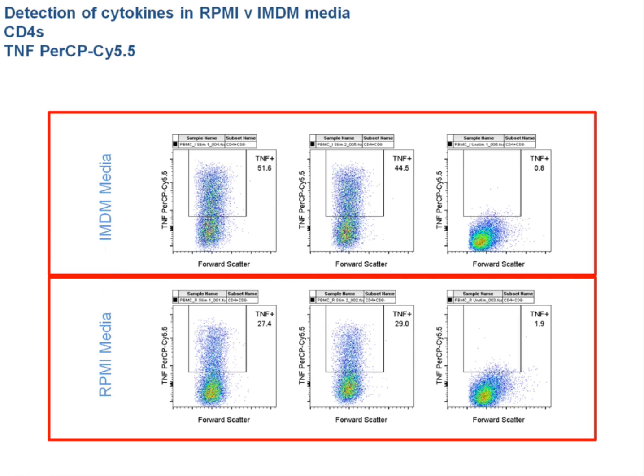Okay, and do you stimulate and block the cells at the same time, or does it matter? Again, in my hands, I often do. A lot of that is just time constraints and practicalities. With blocking, often you'll see an increase in cell death, so you may want to consider blocking just for the last few hours, in particular if you have a long stimulation or a long incubation period.